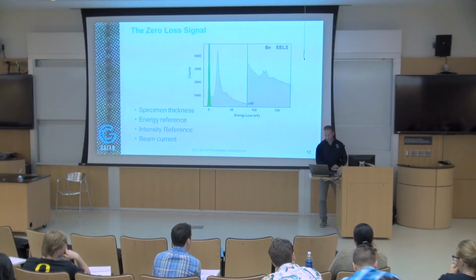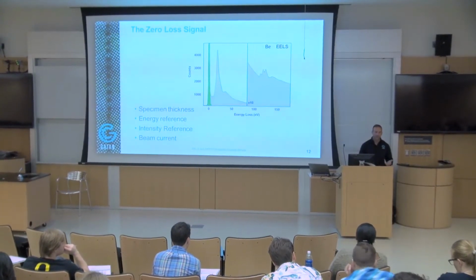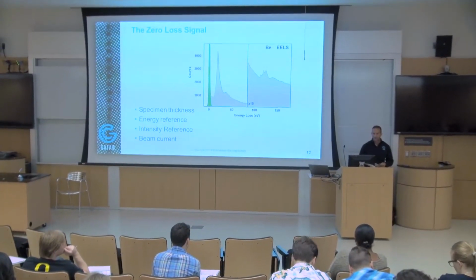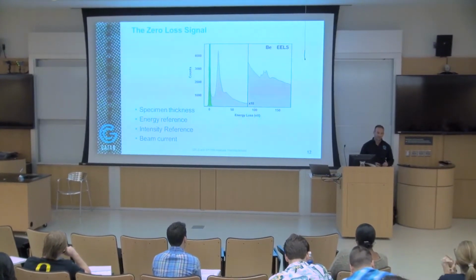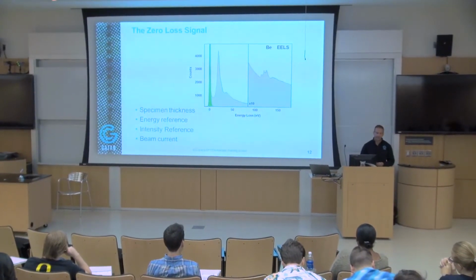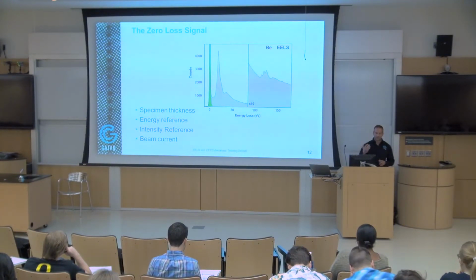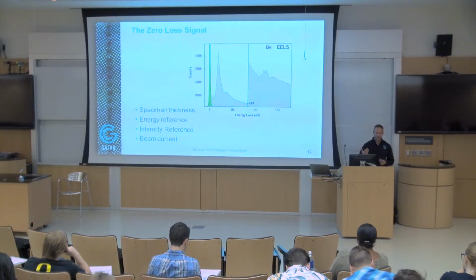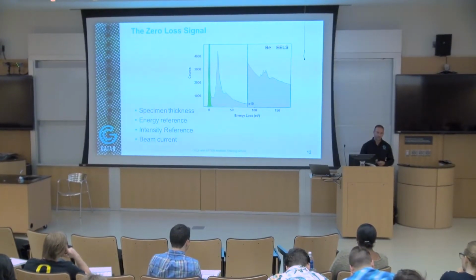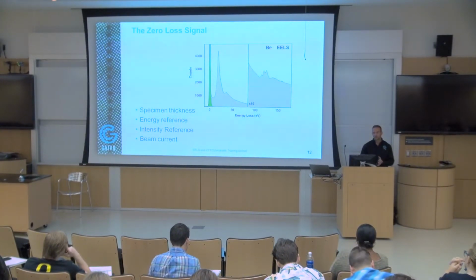Yes. So you could do that. Say that you're looking at silicon oxide. You could just do the quantification and say, okay, it's got silicon oxide. But I think there's a more elegant and more precise way to tell that you have silicon oxide, just by looking at the shape of the EELS spectrum. The fact that you have silicon oxide will influence the near edge fine structure, the fine structure of your silicon L edge or the silicon K edge, and from there you can tell absolutely that you have silicon oxide.